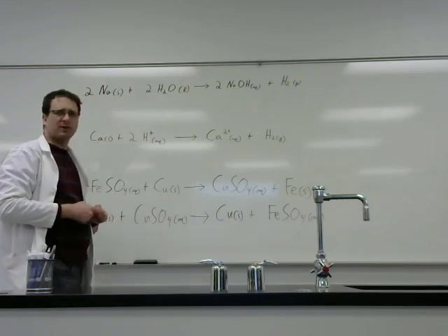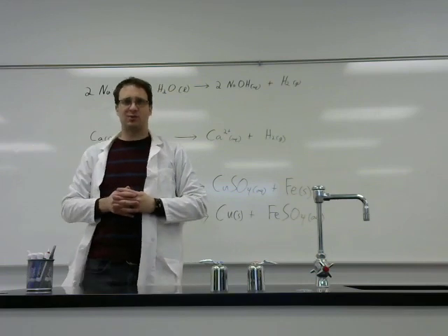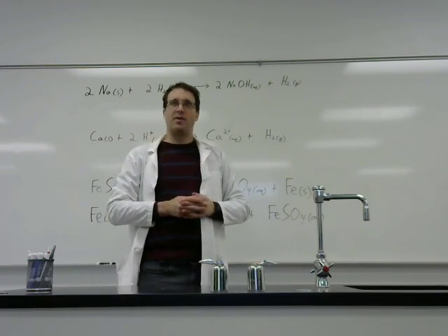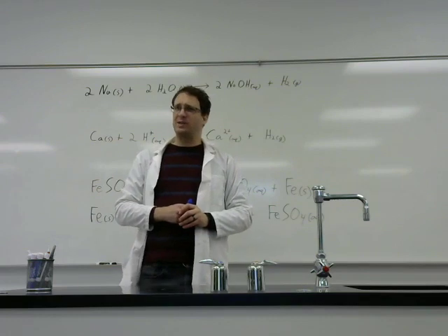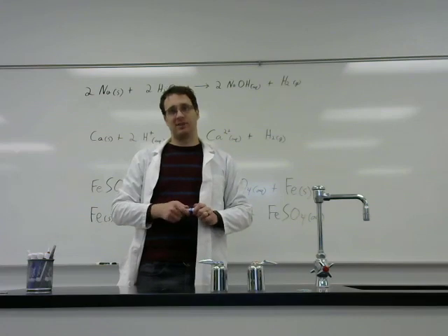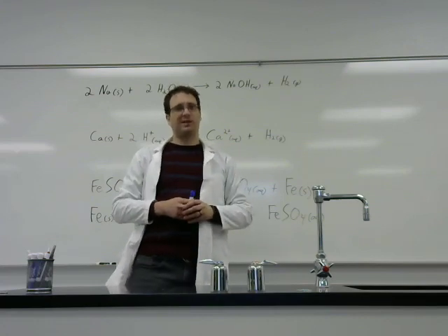Metals will also react with acids. Now you'll see that many of these reactions are just what you might have expected based on maybe like Batman cartoons or something. The metals will react vigorously with the acid. And then some other metals actually are completely non-reactive with acid. And we'll be able to see that and be able to determine a trend in metal reactivities with acid.